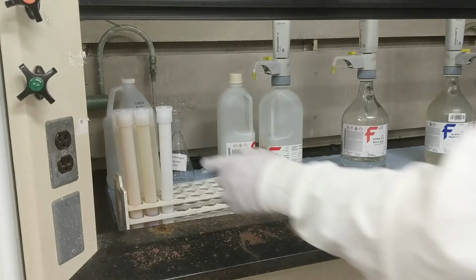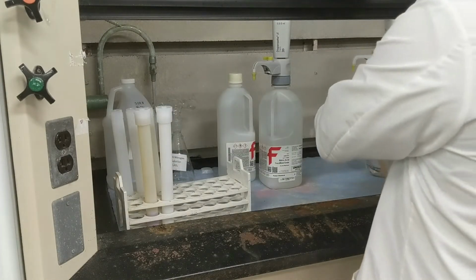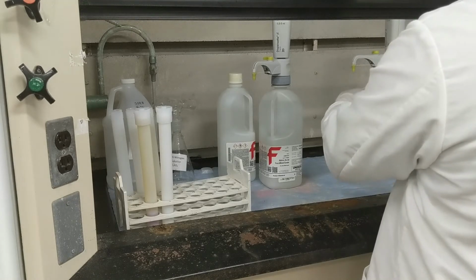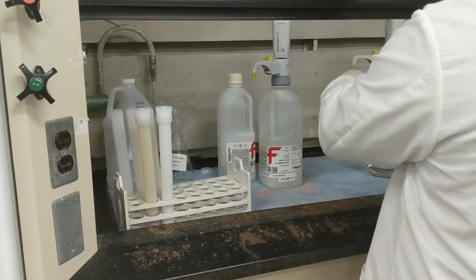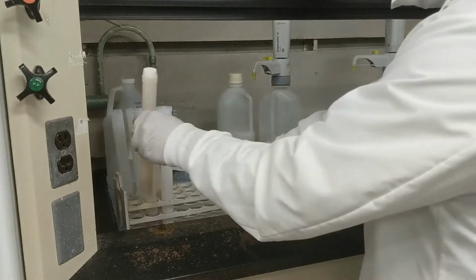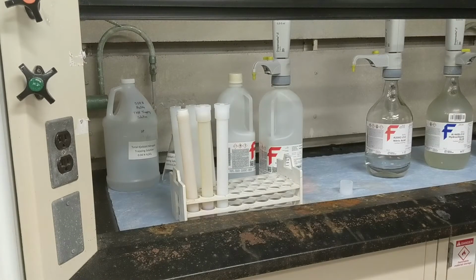Once the samples in the microwave have finished their digest and given enough time to cool, we can take them out and take them to the hood. Now we want to open these pointing away from ourselves and into the hood because they will release some noxious gas that we don't want going toward our faces.